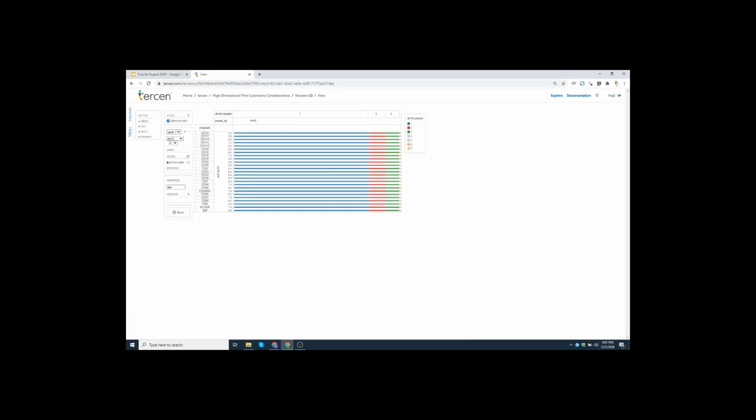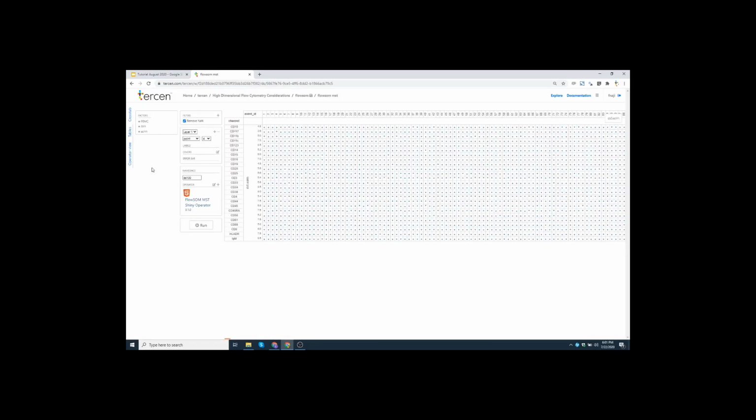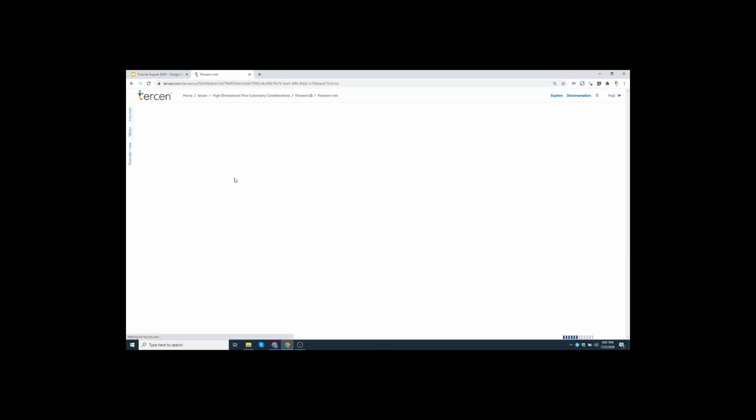and you basically classify all these cells, which represent these events here, into, for example, here FlowSOM has identified 7 groups, and you can also look at what I mentioned, FlowSOM having this ability to show you the relationship of these 7 groups and how the markers are broken down in each of these 7 groups. We call them clusters, of course.